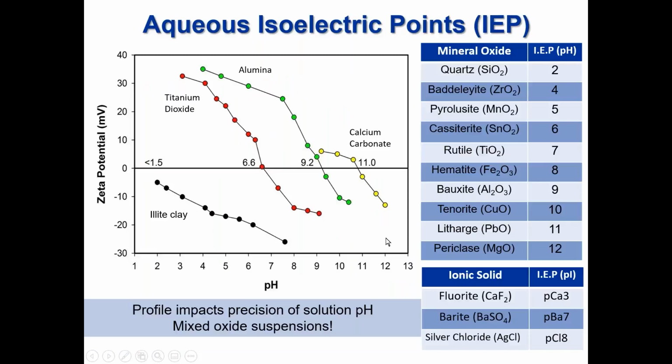They would all run in an appropriate background electrolyte, a so-called indifferent electrolyte. I prefer to call it spectator electrolyte. It watches the game, but isn't truly indifferent. Sometimes it interacts, just like in a ball game itself. As an example is titanium dioxide.